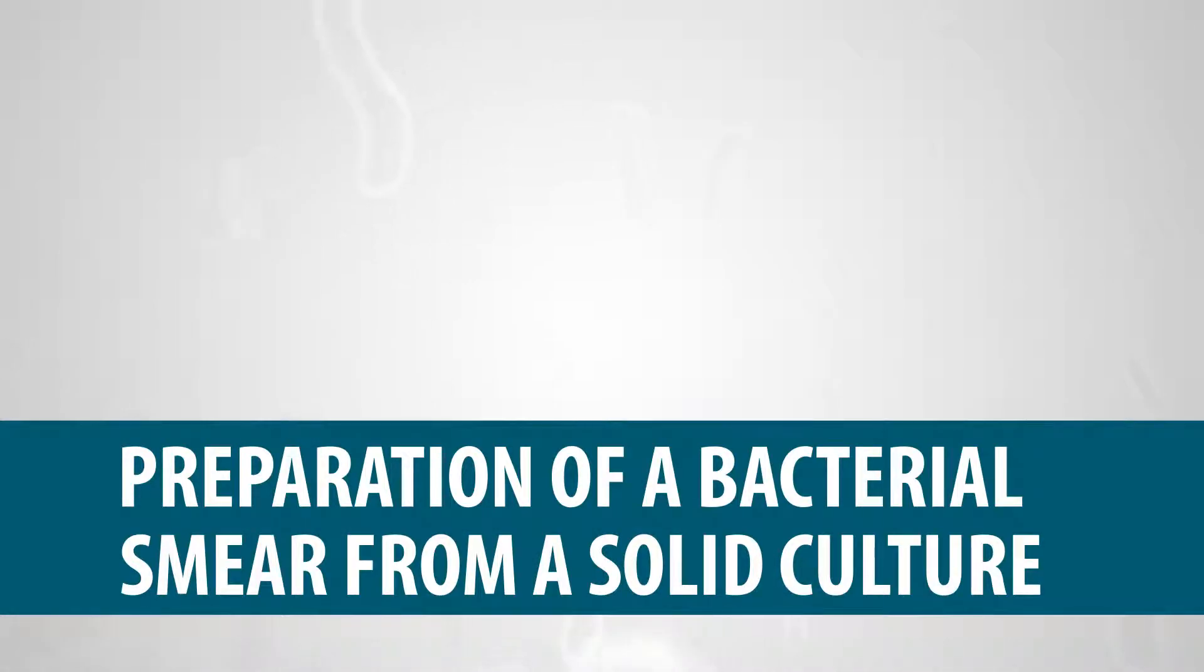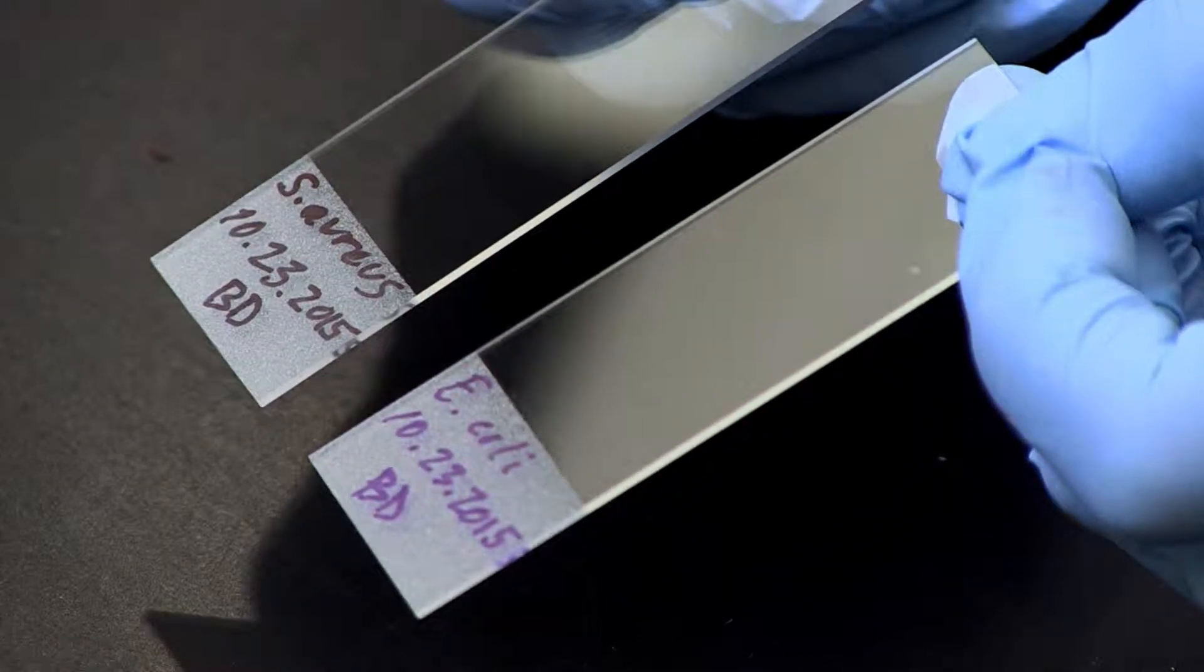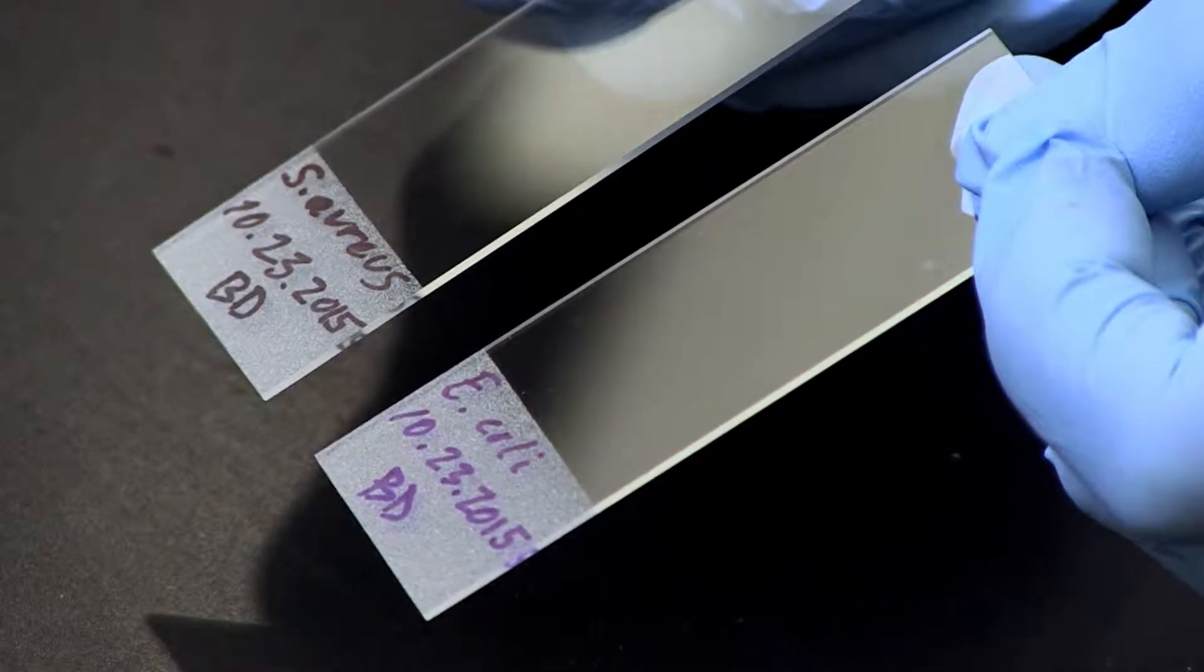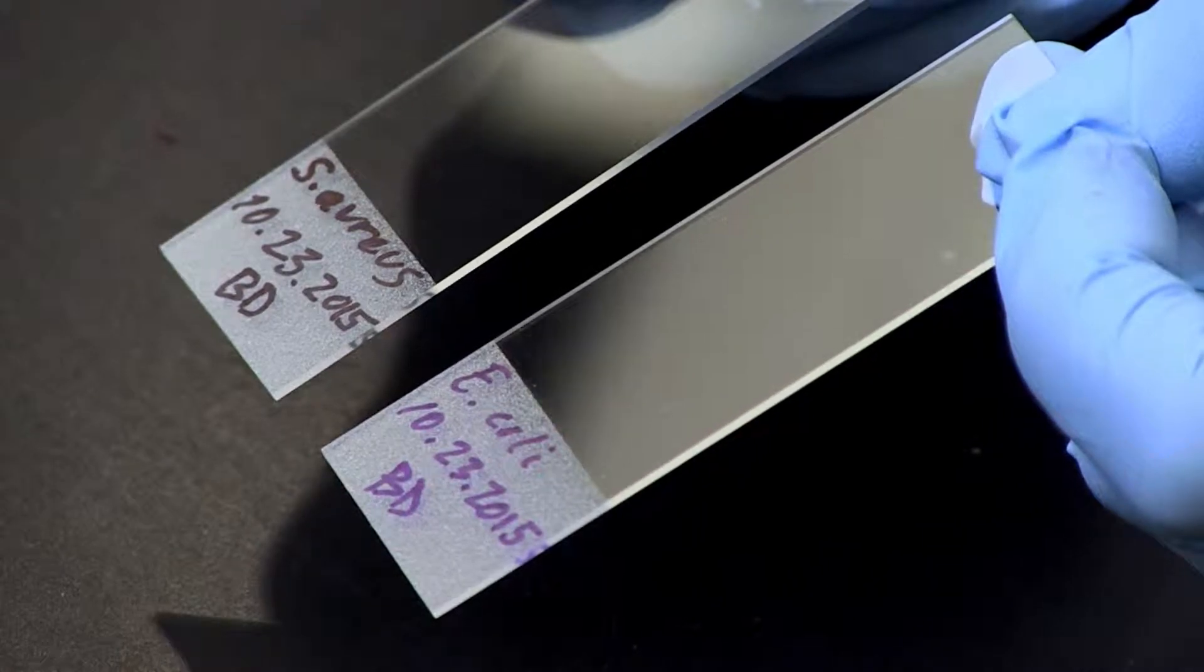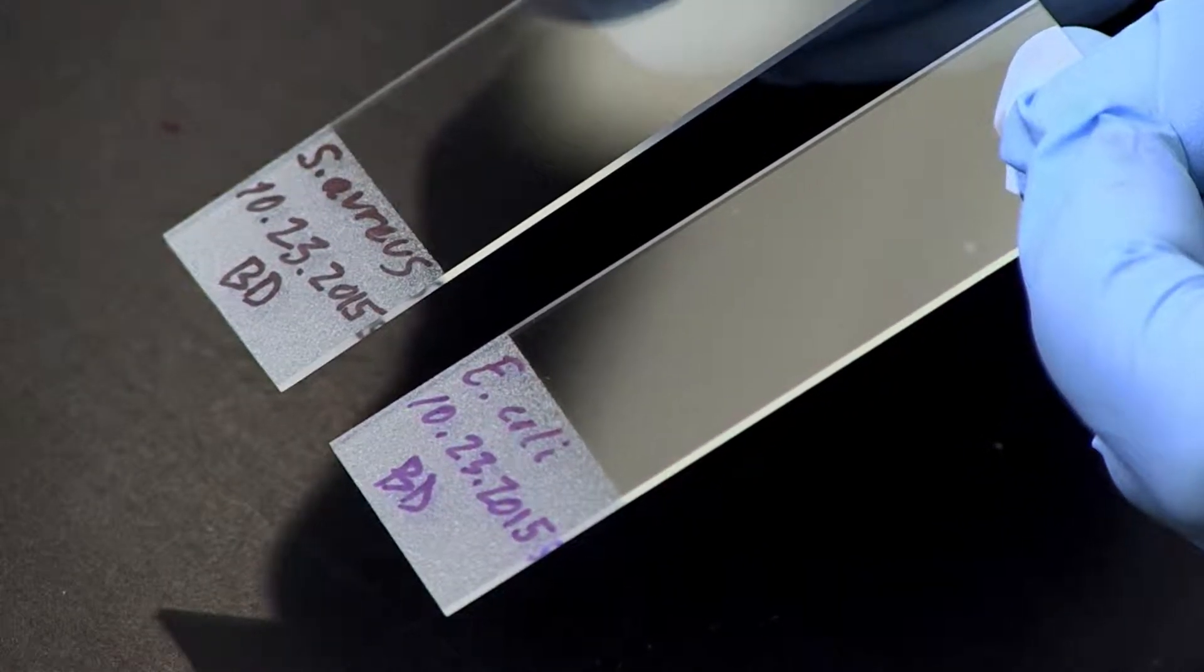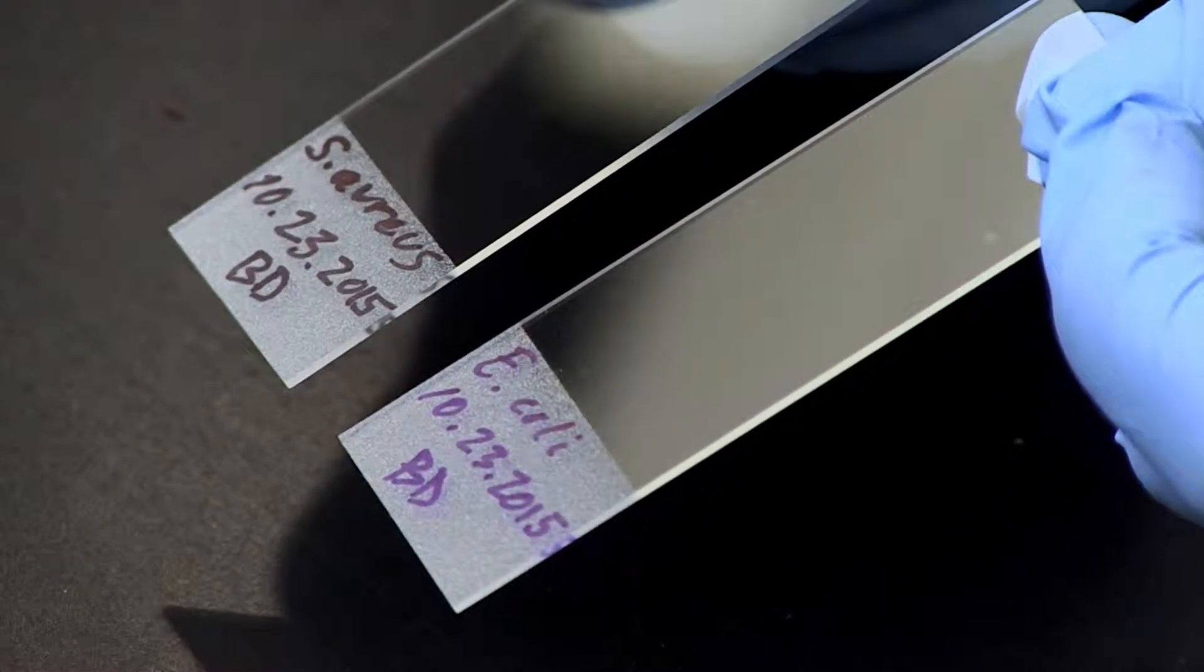Preparation of a Bacterial Smear from a Solid Culture. First, label a clean microscopic slide with the name of the bacterial species used in this exercise, today's date, and your initials.